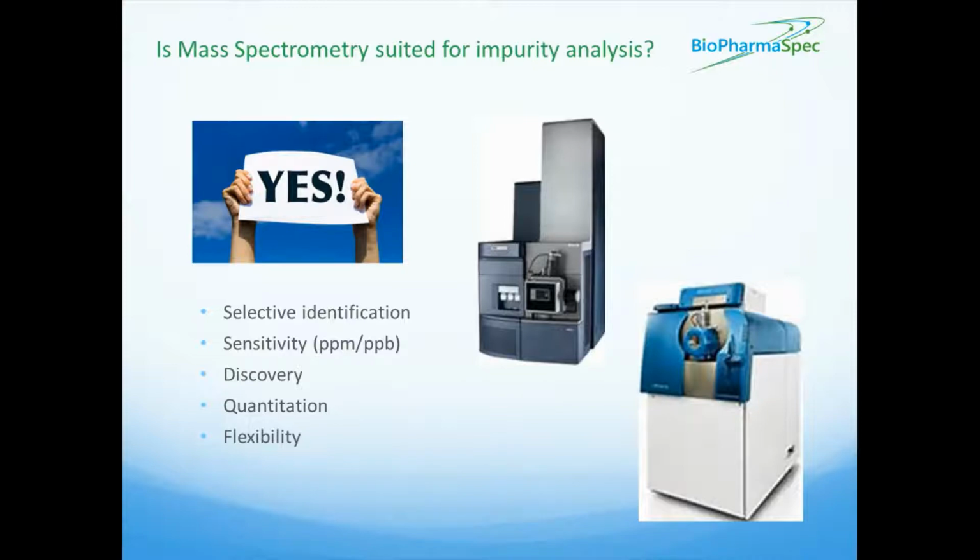Now, the reason for this is because different substances will ionize with different efficiencies in a mass spectrometer. And without getting too deep into this, it's just going to be very important that the standard and the analyte have similar ionization efficiencies to get the most accurate concentration estimate possible. And I'll talk a little bit more about this later in the talk when we get into a few specific assay examples.